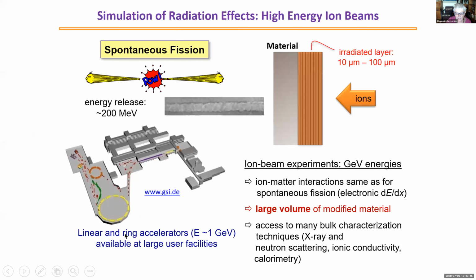Again, if we just say what we did, basically, samples were irradiated in Darmstadt, and then they have to be allowed to cool down somewhat to get rid of short-lived isotopes, and then they're ready to be handled for structural studies, neutron diffraction studies, etc.